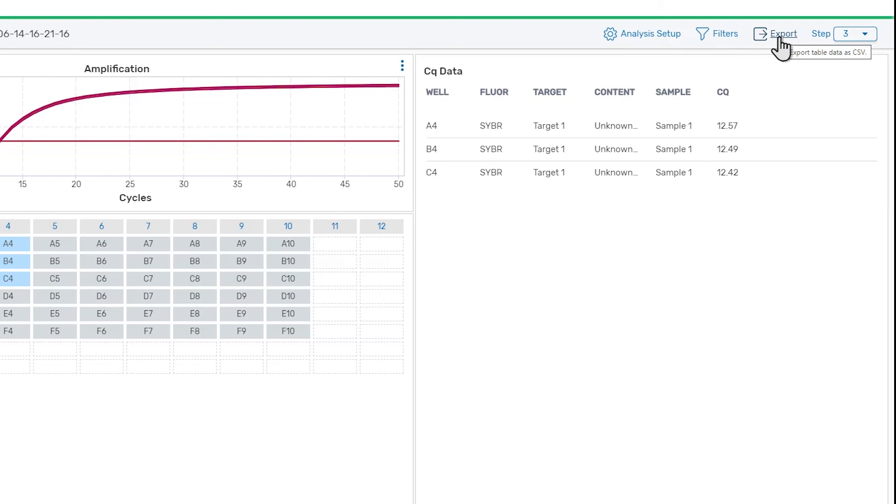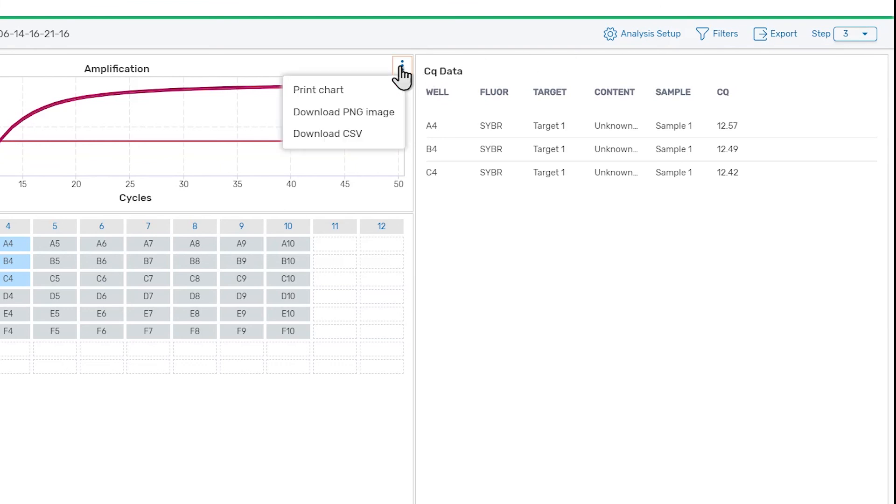If you wish to export the RFU data for the wells instead of CQ data, this can be done by clicking on the Menu button at the top right of the amplification chart, and selecting Download CSV. From this menu, you can also download or print the image of the amplification chart for your lab notebook.